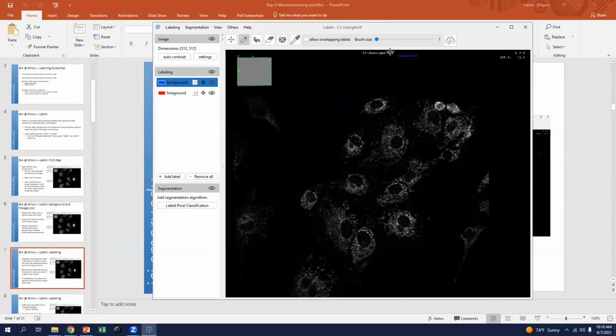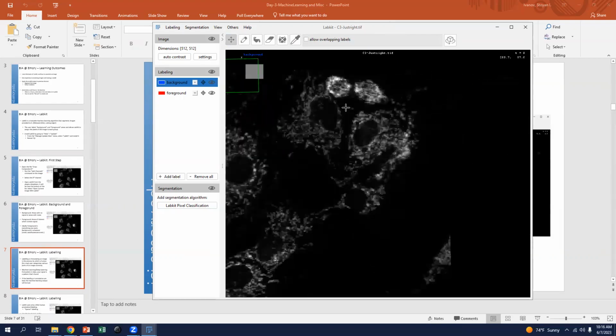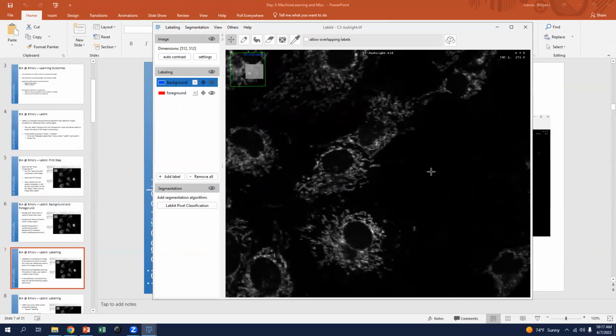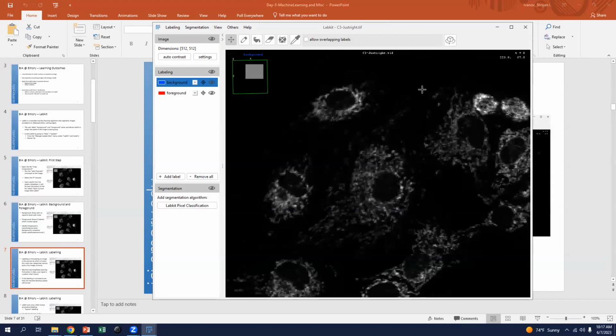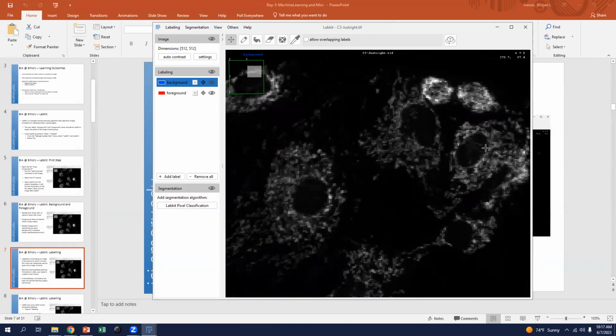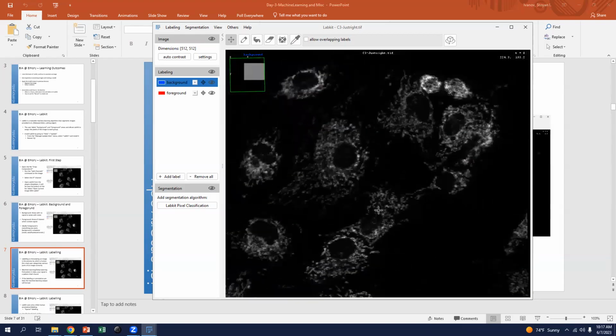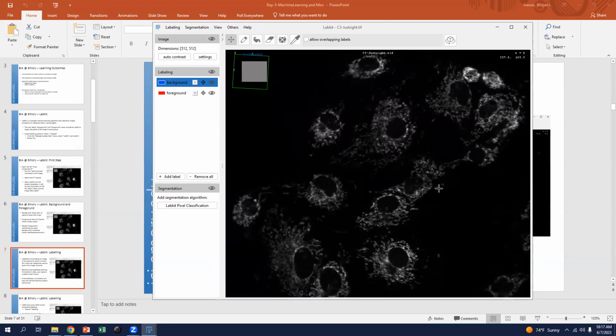So as we look at this image, we see maybe a couple of different kinds of background noise. Obviously the larger area and these perhaps internals as well that might somehow be a little lit. And we have maybe 2 or 3 types of signal.